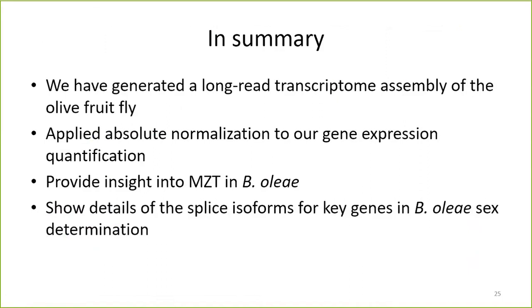We provided some insight into the maternal zygotic transition, and we show that between the first hour and the second hour, you have about a 50% reduction in the amount of mRNA per embryo, which basically doubles in the third hour, a kinetic that is really, really dramatic. We also tried to improve the annotation of genes, especially these key genes that are involved in sex determination that might be very useful in controlling the populations of these insects in the field. We provide better annotations for these genes. And I think this is what we've done.